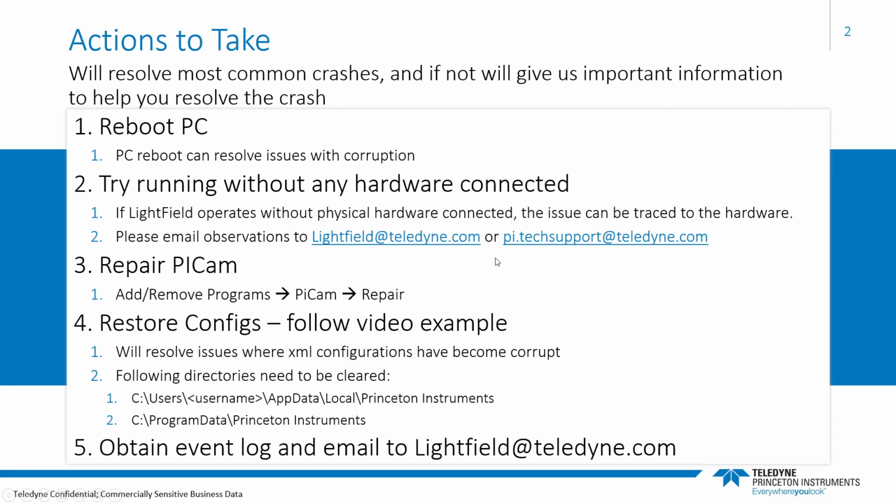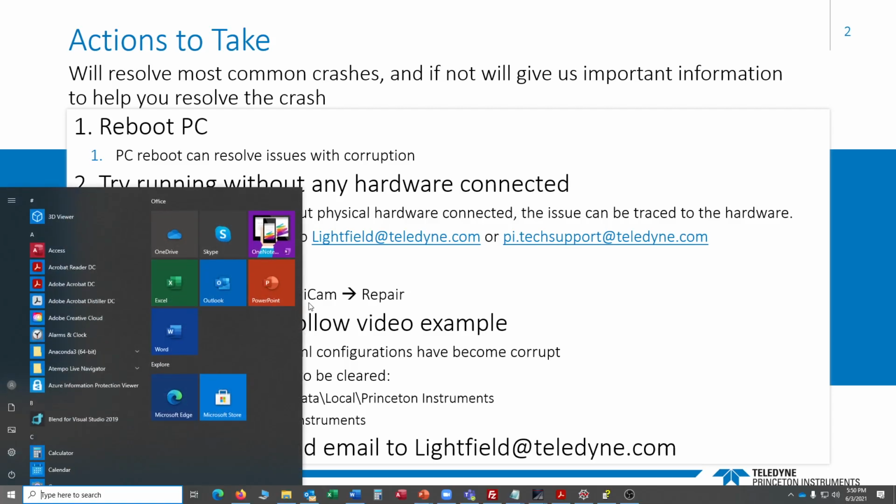The next thing to try is to repair PICam. PICam is the driver underneath LightField. You can call it its foundation, and this is what drives all of the hardware. So if this gets corrupted, then the software won't work. You want to go to Add Remove Programs, find PICam and repair it. So I'll show you an example here.